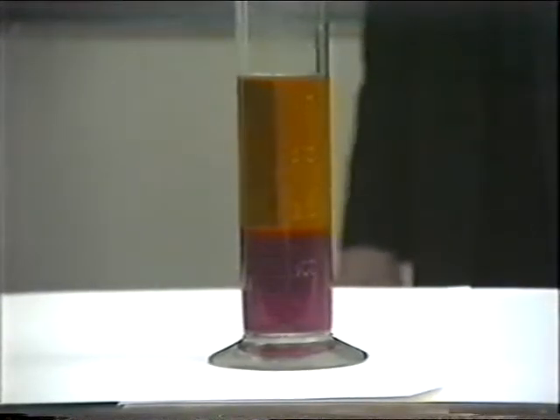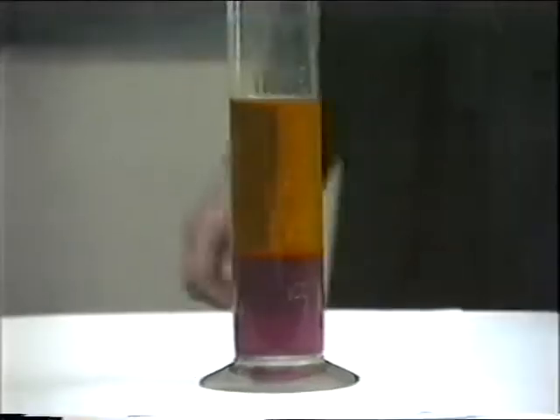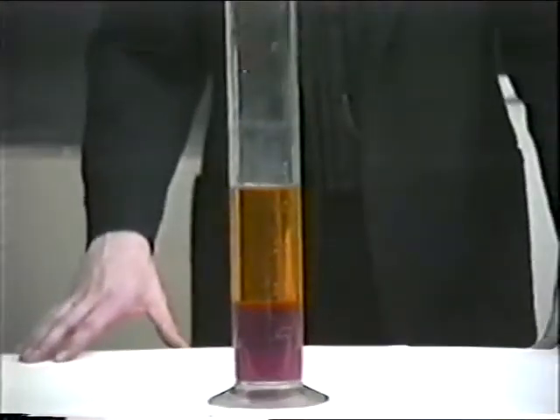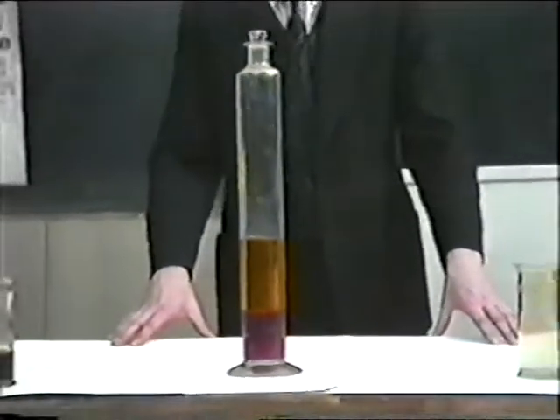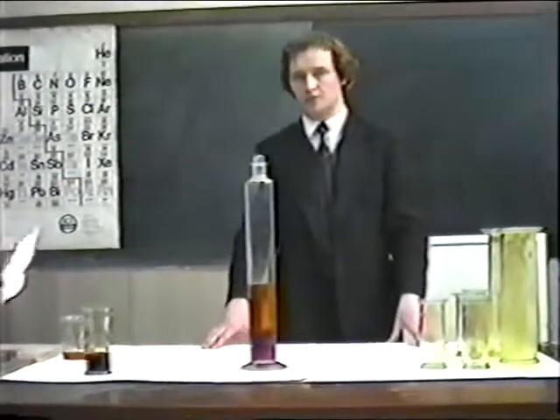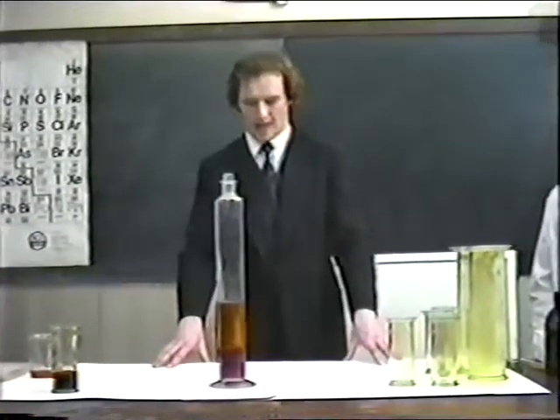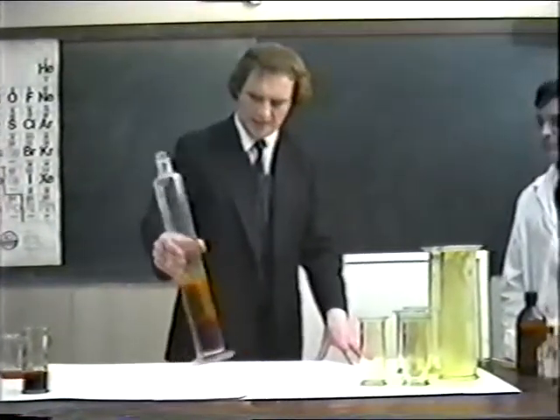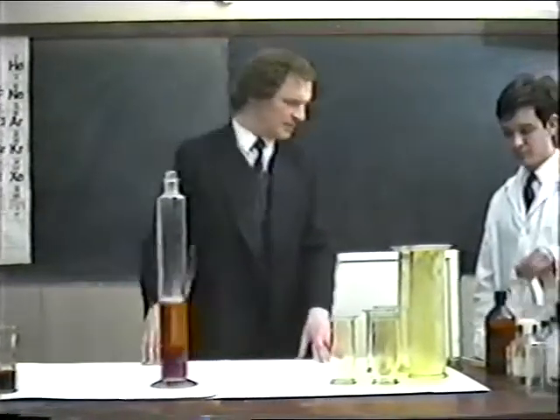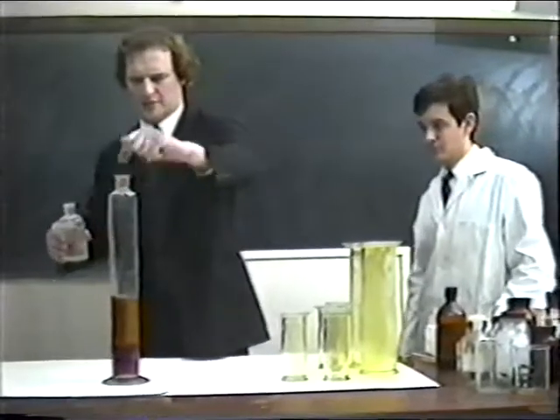Now iodine is in fact the only substance which dissolves in water to form a brown solution and in trichloromethane to form a pink solution. We have therefore demonstrated a reaction which is unique to iodine, thus showing that iodine was formed in the previous reaction. Incidentally, a little sideline, if you pass me some sodium thiosulfate solution, you observe another interesting reaction of iodine.